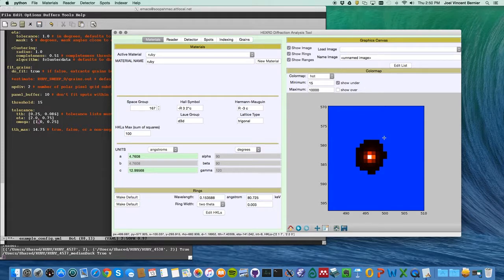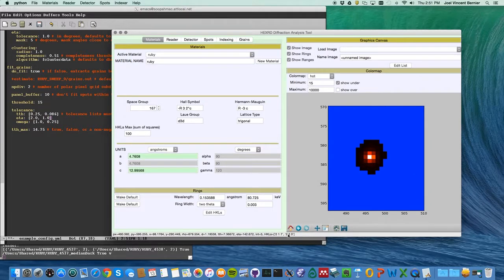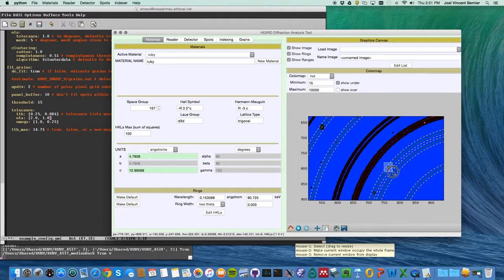if I want to draw a box around it, I'd start at what, 141 here, goes to 142.0, 141.0, so a degree for this particular spot is more than enough to fit the overall size. So giving it 2 in the first step, I can give this 1 degree here so it can get all the tails. And then in the 2 theta direction, which is a radial direction, remember, going out, let's just pick a spot like this guy here.